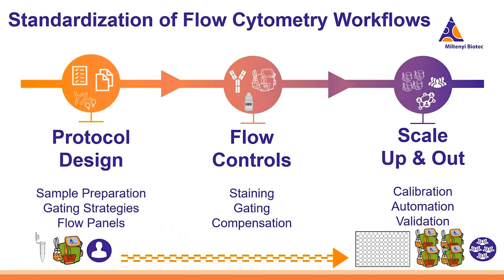And in summary, we talked a little bit about considerations pre-flow cytometer in terms of protocol design, sample prep, gating strategies in your flow panels. We discussed some flow controls that you can run as you're acquiring your data, such as your staining controls, your gating, and your compensation. Then finally, we had some considerations for scaling up and out and ensuring standardized reproducible data through calibration, automation, and validation of your flow assays.